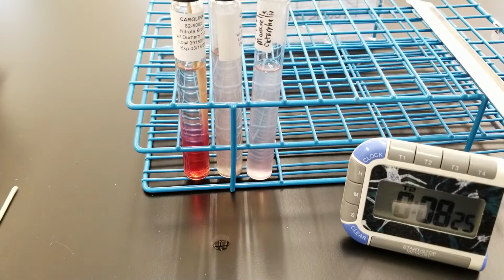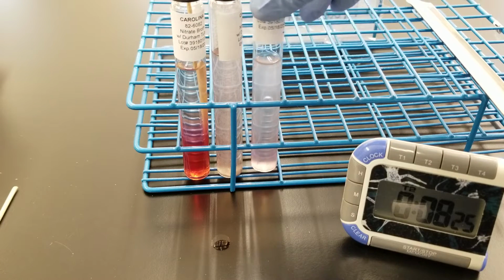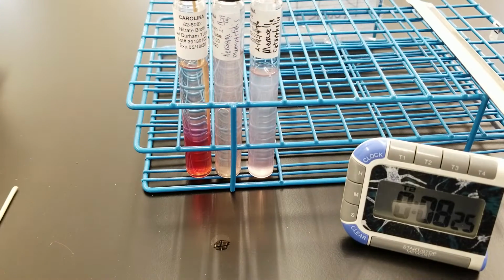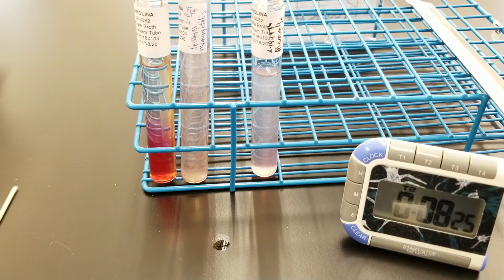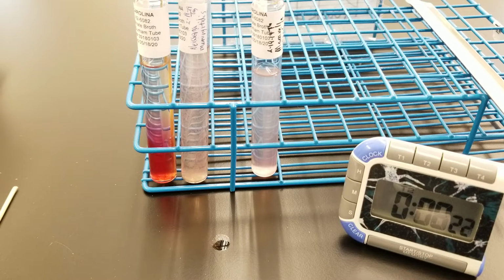Then we have the other two. This is your true positive, which is your Moraxella catarrhalis, okay? And then you have your Neisseria is a negative, true negative, so we'll put those over to the side. Visually, you can see that. And the left one's on the control. Oh, I forgot to start that back up. So there you go. That is how this works out.